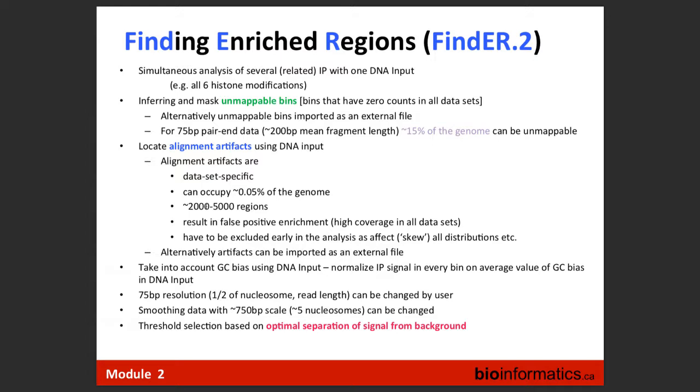Then, regarding peak calling, just a few words. I talk about something which I understand, which I have been thinking about for a couple of years. It's Finder. We had a tool published some years ago, called FindPeaks, which was developed very early, kind of from necessity. We had to analyze ChIP-seq data, and this tool was based on the statistics of whole genome shotgun sequencing. However, these statistics broke when we looked at modern ChIP-seq data, and we started developing something else with a different statistical model.